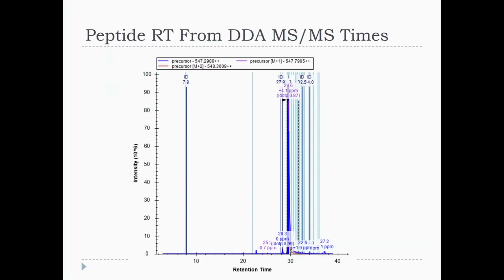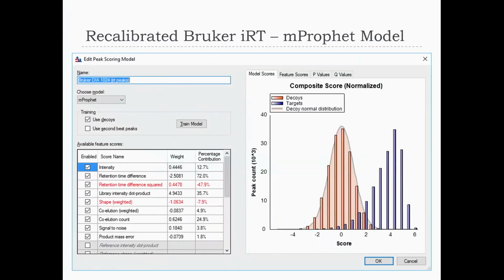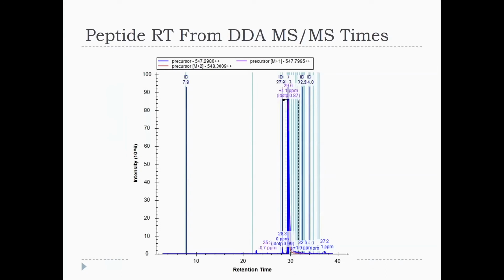Tailing, exactly. Nice. So it turns out that in this chromatography, there were 3 peptides that had this kind of tailing. First, we were doing our IRTs using the mean retention time, which I decided is crazy because now the tail impacts the mean in a big way.